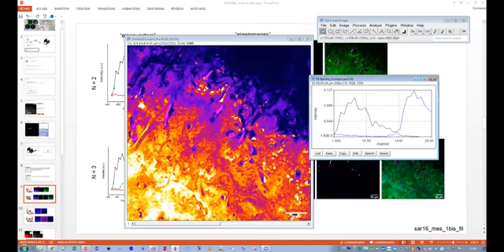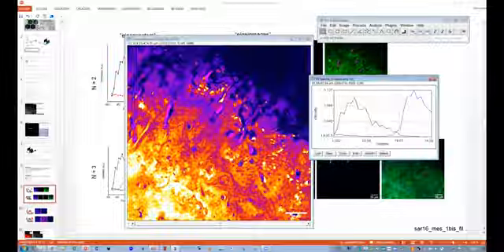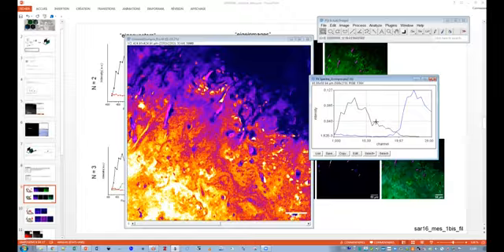My assumption is that in the most intense pixel, I have almost the pure component. And the contrast is that you have less pure component with that kind of spectra. Okay. Thank you. But it's my assumption.